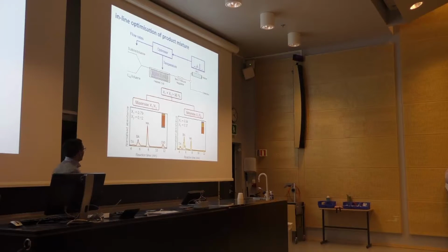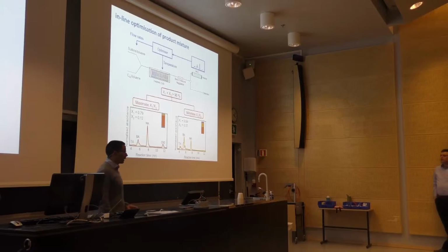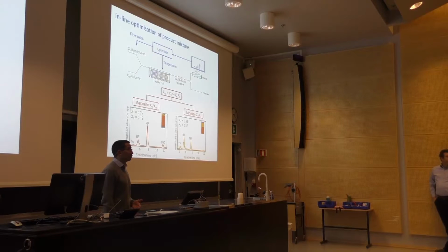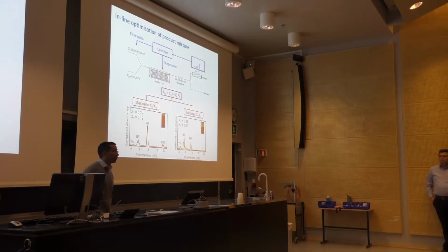So implementation is very straightforward. It really adds no complexity, and not so much in the case I've shown here, but for some of the things James will show, that back pressure regulator also improves the flow characteristics immeasurably. So I think we invariably use back pressure regulators these days. Would that be fair to say? Yeah, in a continuous flow system. In droplets it's a bit more difficult.